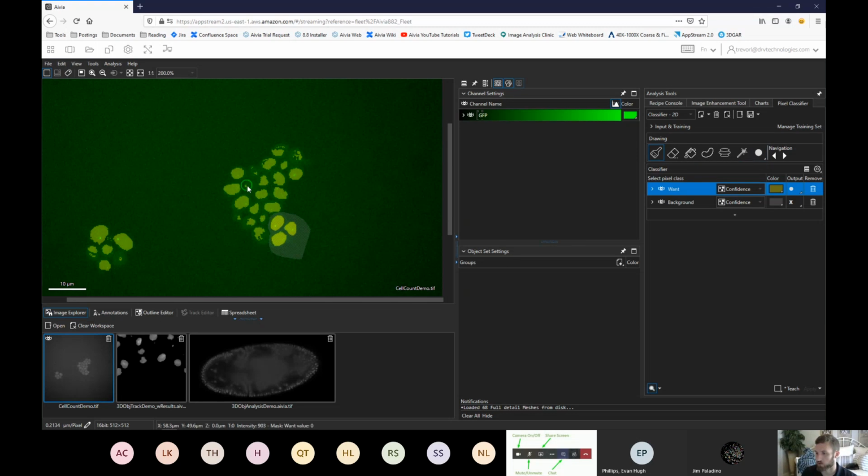I don't like doing that because it means I have to keep going back and forth. If you hold Control and Shift on your keyboard and then scroll with your mouse wheel all at once, it will change that brush radius for you. Then if you make it smaller, you should be able to paint in some of these missing areas and see those light up.